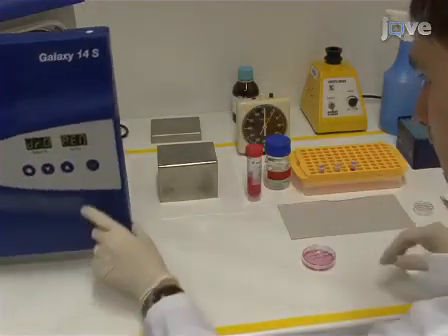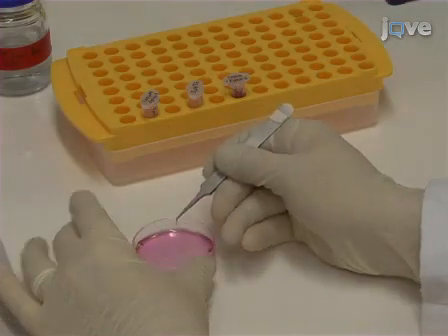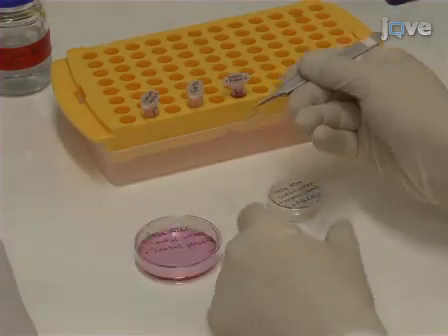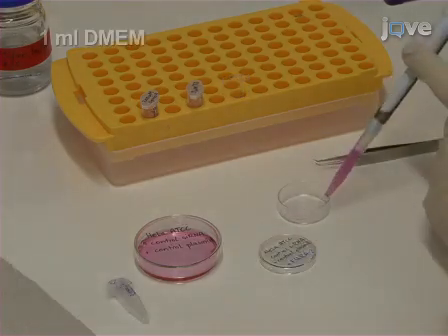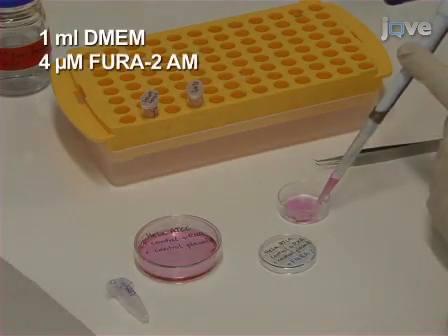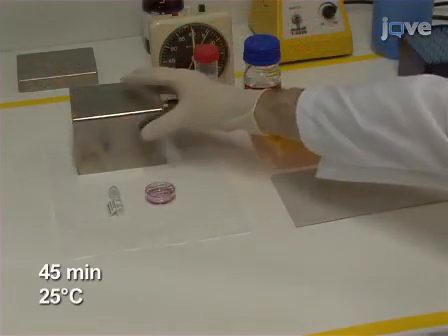Prior to imaging, use forceps to transfer the cover slips with the transfected HeLa cells to a new 3.5 cm cell culture dish and add 1 ml of DMEM with 4 micromolar Fura2. Incubate for 45 minutes at 25 degrees Celsius in the dark.